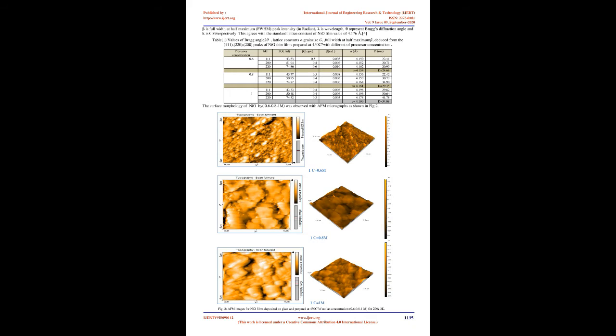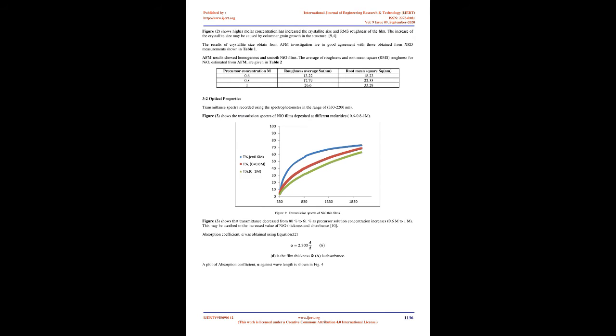Nickel oxide, NiO, material has a structure like NaCl type with lattice parameter 4.177 Å. It offers promising candidature for many applications such as solar thermal absorber, catalyst for O2 evolution, photoelectrolysis, and electrochromic device. Nickel oxide is also a well-studied material as the positive electrode in batteries. In this paper we prepared thin films by the spray pyrolysis, SP, process owing to its several advantages such as low cost of the apparatus, large area with high homogeneity and easy control of structure of the deposited films.